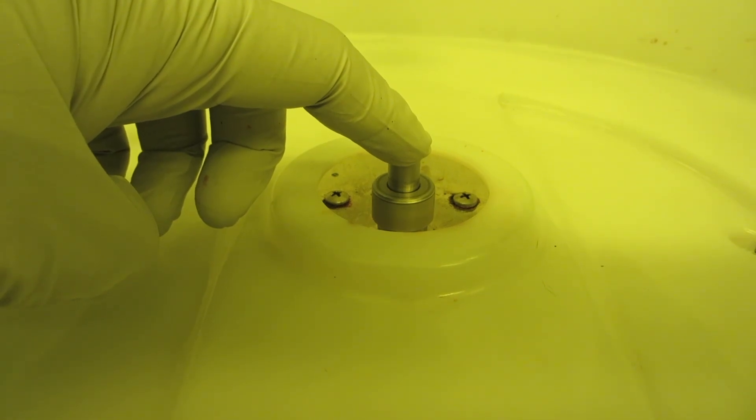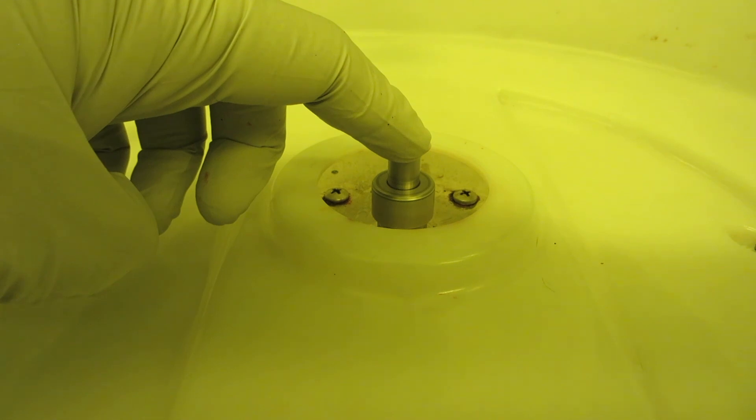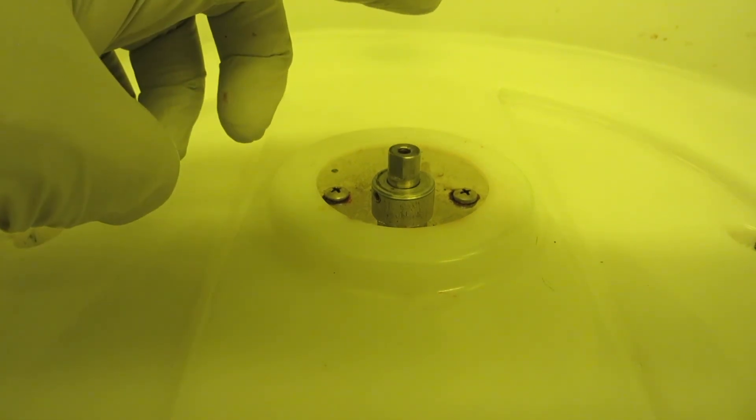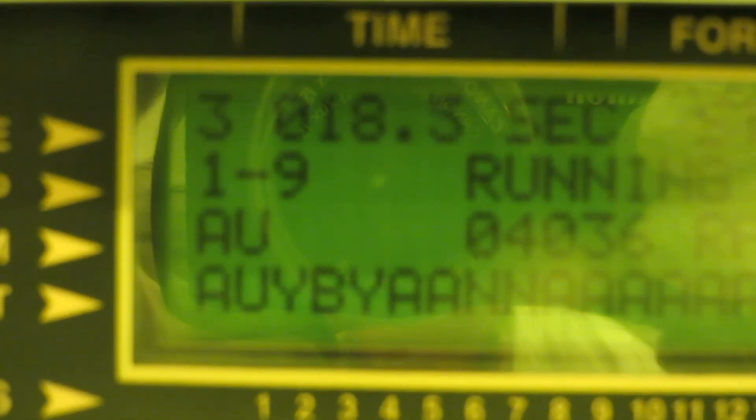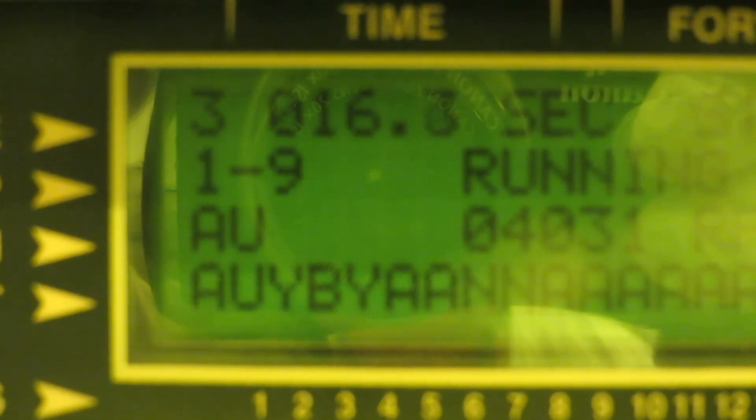If you are working with very tiny samples, way smaller than this one, please don't flood the resist completely over the sample. Try just to put the resist on top of the sample. That will really help in keeping resist from getting down the vacuum hole.